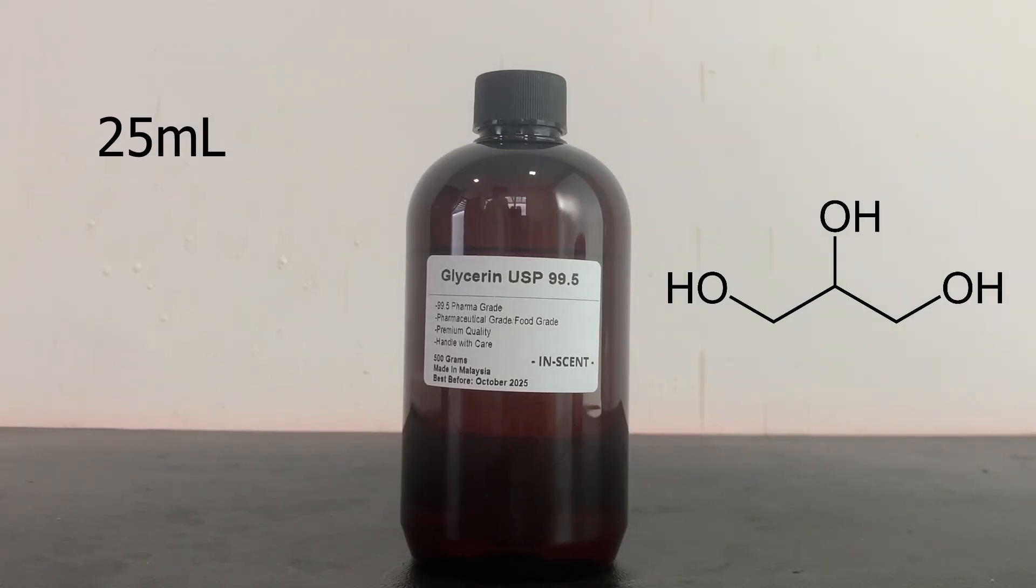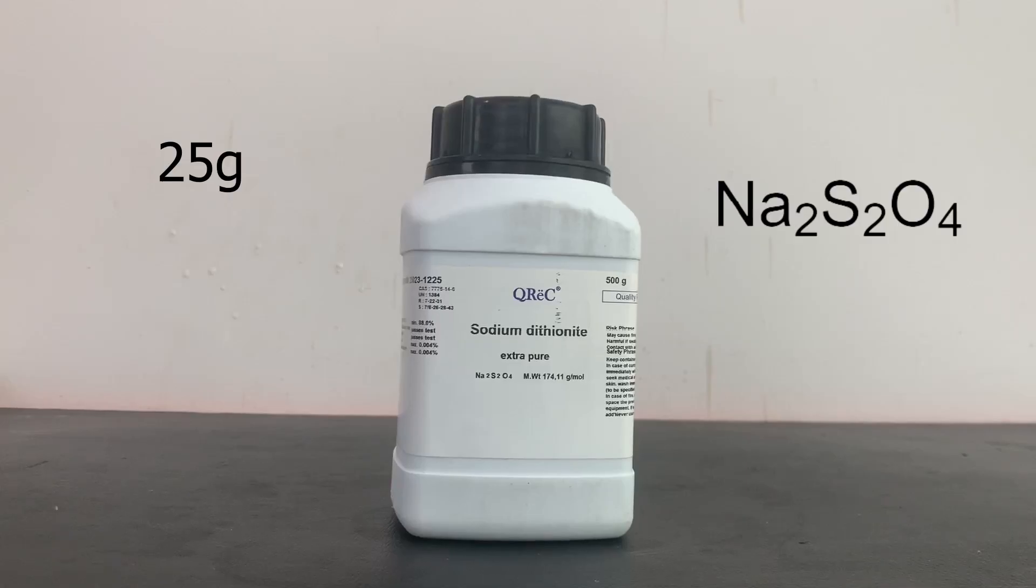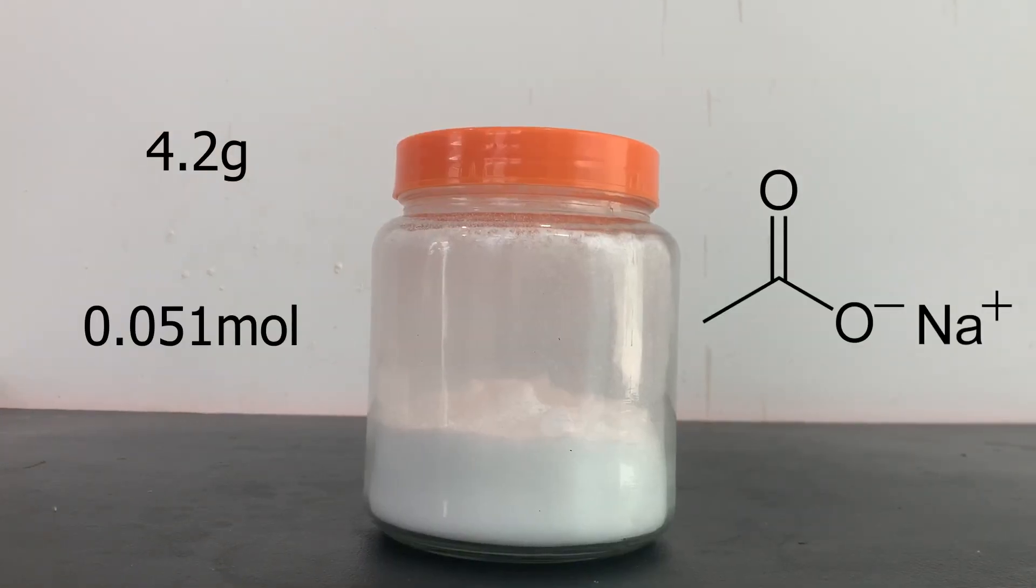We will also need 25 milliliters of glycerin, which can be bought from pharmacies, 5 grams of sodium hydroxide, which can be bought as a drain cleaner in hardware stores, 25 grams of sodium dithionite, and finally 4.2 grams of sodium acetate.